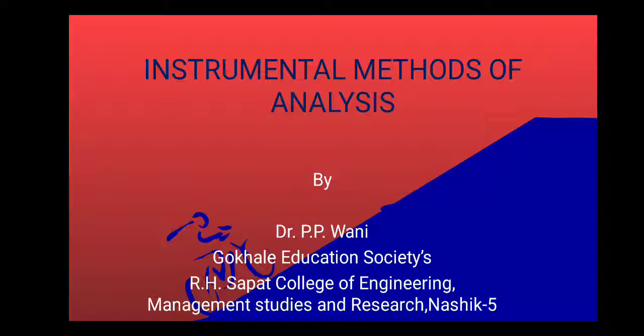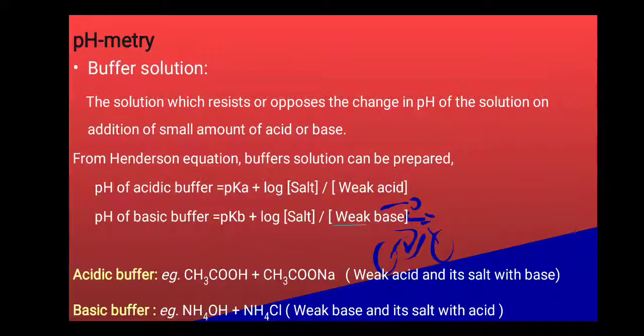From this video, we are able to learn what is pH metry, how you can measure the endpoint for a strong acid, strong base titration using measurement of pH. You know that the pH of the solution is nothing but the negative logarithm to the base 10 of the concentration of H plus ion. That is called the pH. So for that we require some terms to learn pH metry.